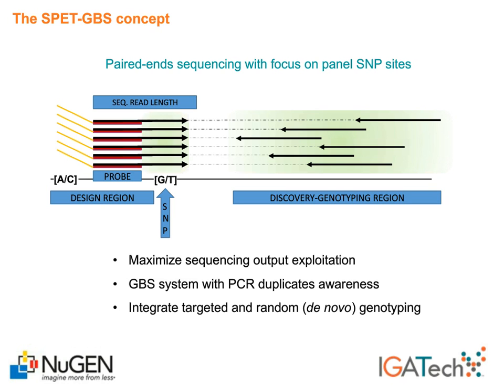In this way, the maximum distance is given by the remainder of the sequencing length after the probe itself. One caveat was to avoid at most any further SNP site residing in the 3' end of probes, and avoid any allele-specific extension.